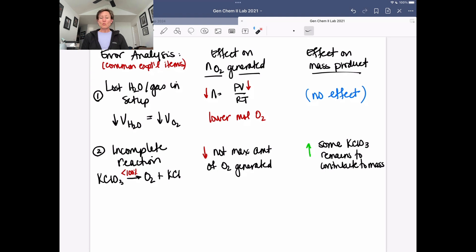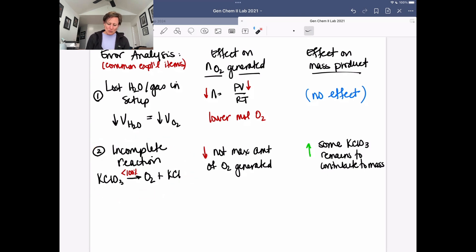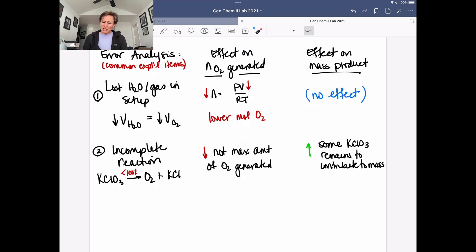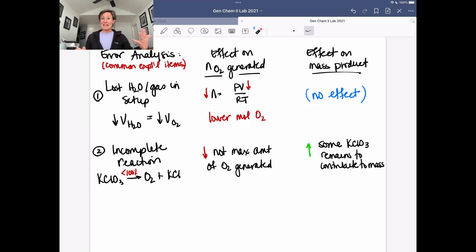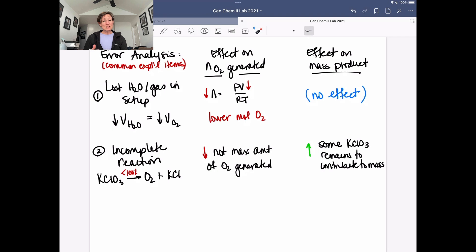Another common scenario is an incomplete reaction. If the reaction doesn't go to 100%, we have some potassium chlorate left over and are not generating as much oxygen — so moles of oxygen are decreased. But the mass of the product will appear larger. Even though you have less potassium salt because some reactant remains unreacted, that unreacted potassium chlorate — which is heavier — is mixed in with the product solid, giving a higher apparent product mass.